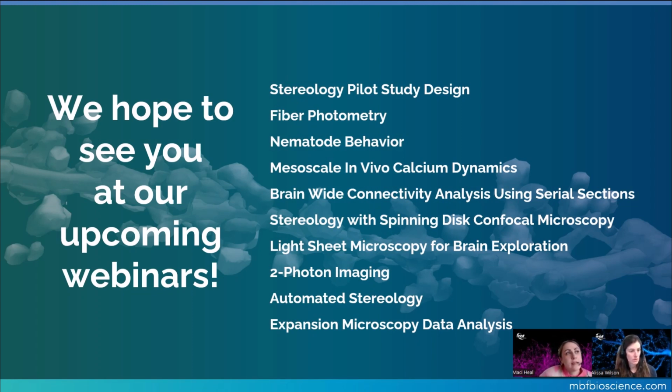Yeah, and even for the user guided, so that interactive tracing method, I find that the different algorithms, so we have voxel scooping, directional kernels, and Rayburst crawl available in the software for the user guided tracing. And since those algorithms work a little bit differently to detect and generate those seed points, I find directional kernels, for instance, produces more points along the center line than, for instance, voxel scooping. So if you need that denser tracing, I would explore those options.